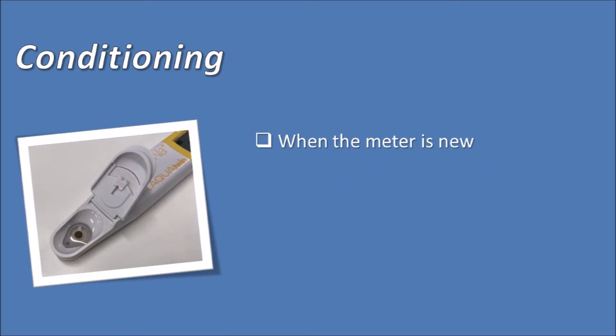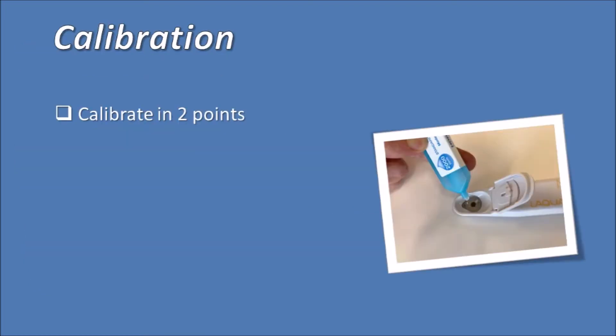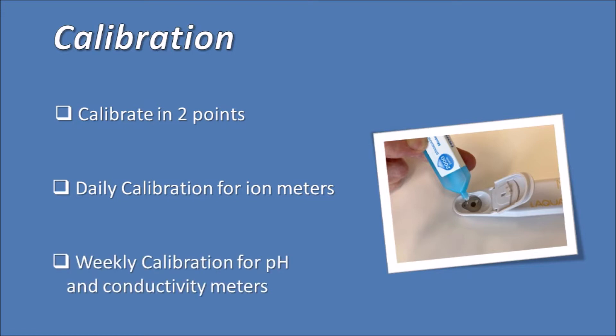Prior to measurement, condition the electrode if the meter is new or has been stored for two weeks or more. Please check the link for sensor conditioning. Make sure to calibrate the meter in two points. We recommend a daily calibration for the ion meters — nitrate, potassium, calcium, and sodium — and weekly calibration for the pH and conductivity meters.